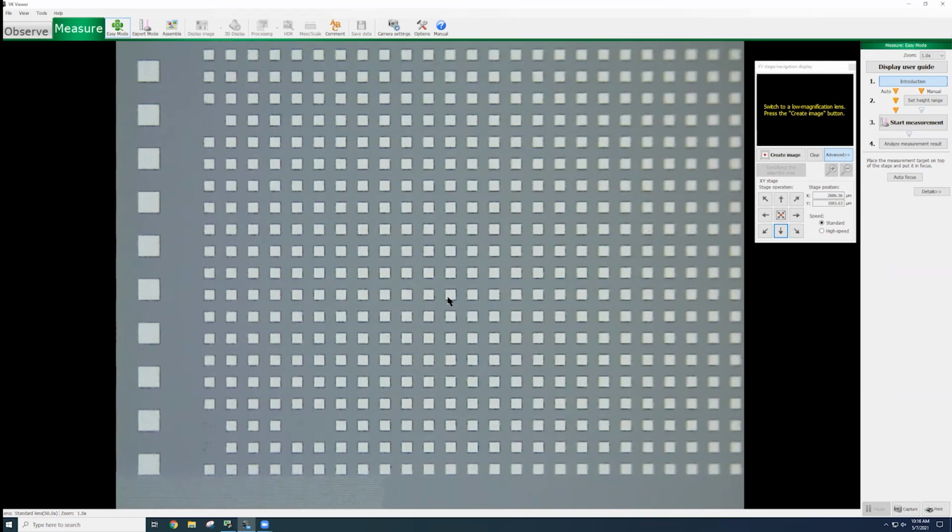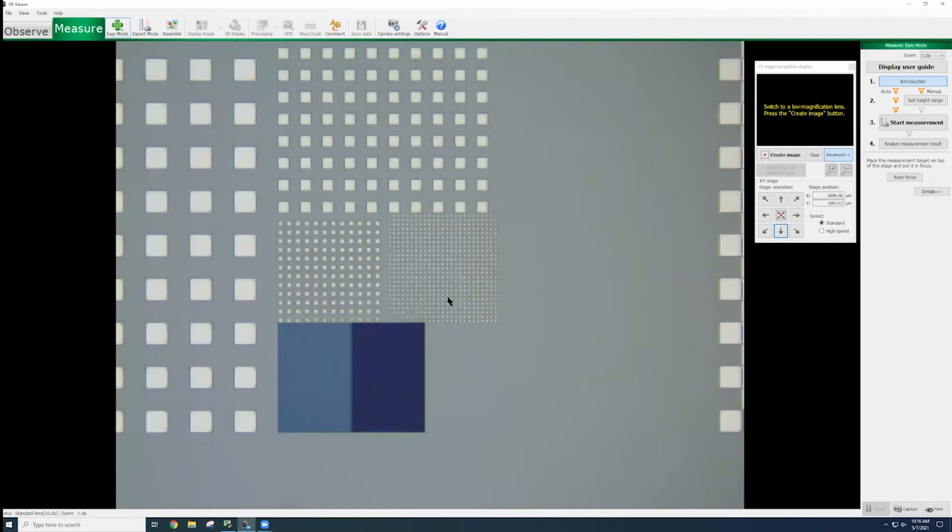I think mainly because if you look at my video here, the stage is just, if you put the sample on the stage, it's not a specific sample holder, so you can't necessarily center your sample to a particular XY coordinate. Okay. Excellent. Thank you. Grant, this is Peter again.